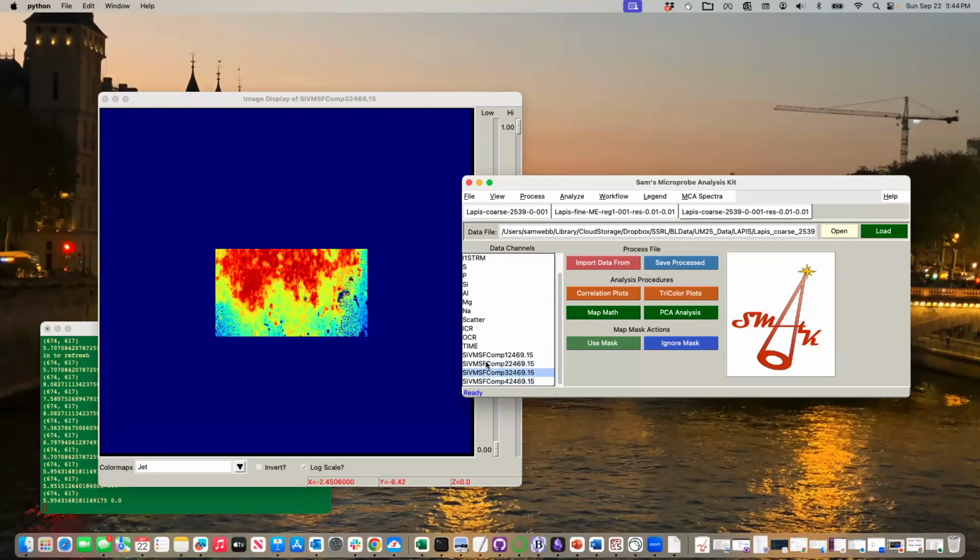You can always choose to go downscale rather than upscale, but I usually go to blurry or coarser stuff. Now you could even say, let's do a tricolor with this data.